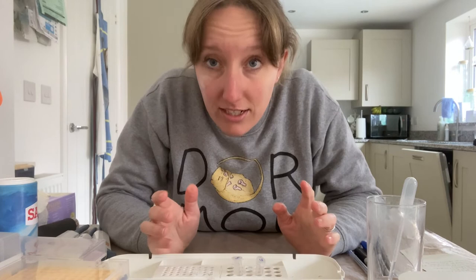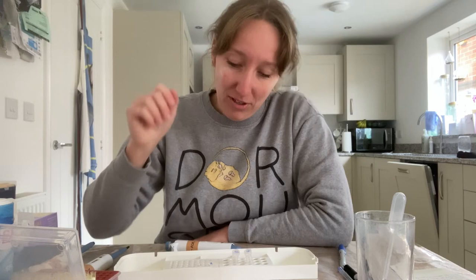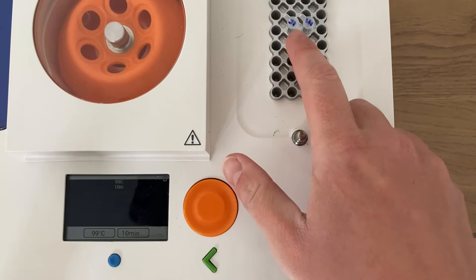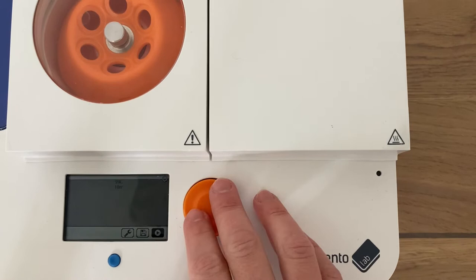The next step is to put these on the Bento Lab heat block. The microcentrifuge tubes won't fit on the PCR heat block, so I'm going to pipette those samples across into PCR tubes that do fit. I have my two replicates — J1 and W1 — on the PCR block now. I've already set it up for 99°C for 10 minutes, so I'll close that lid and set that running.